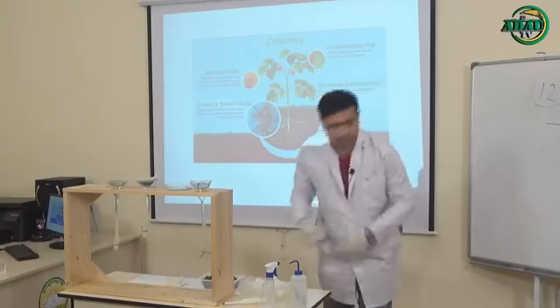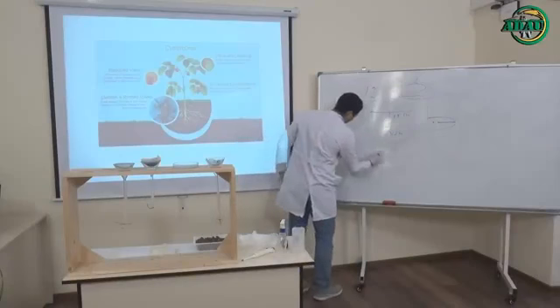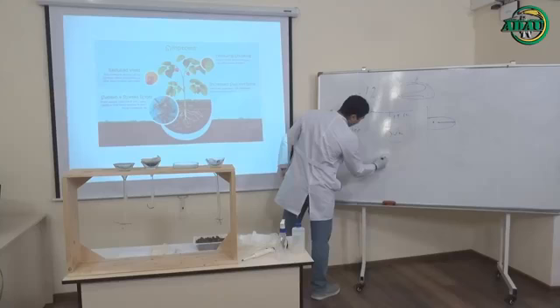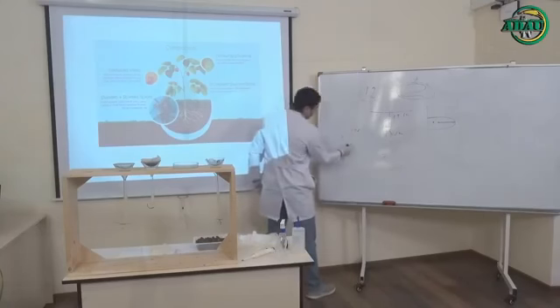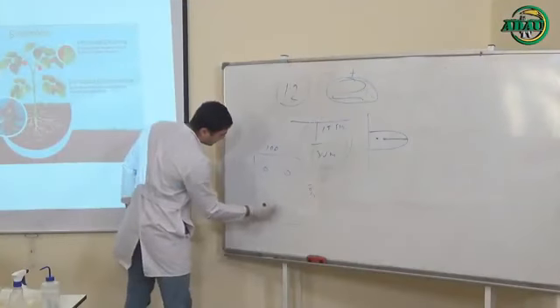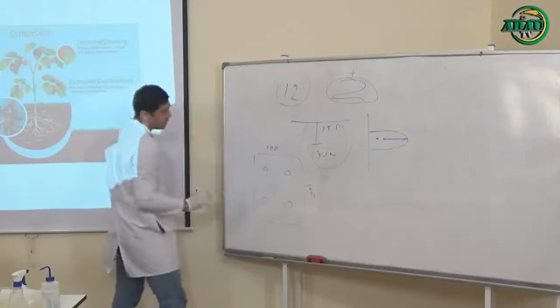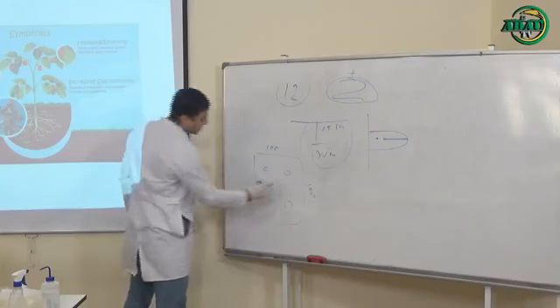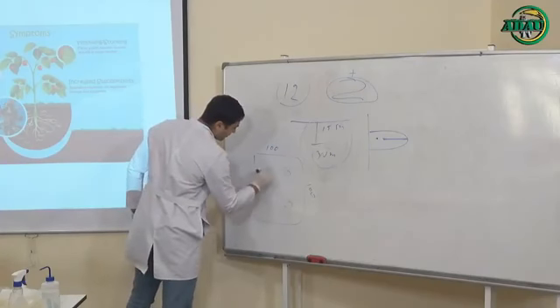If you have a field of 100 meters by 100 meters, you can take samples from different places, like this. You can take from here, here, and other places. You should check your samples one by one.